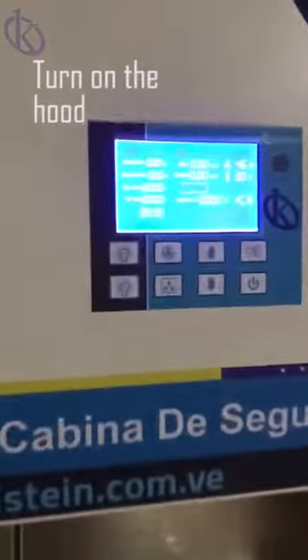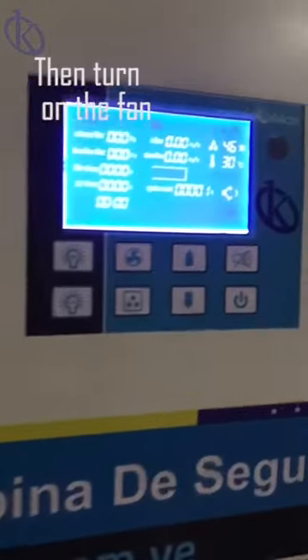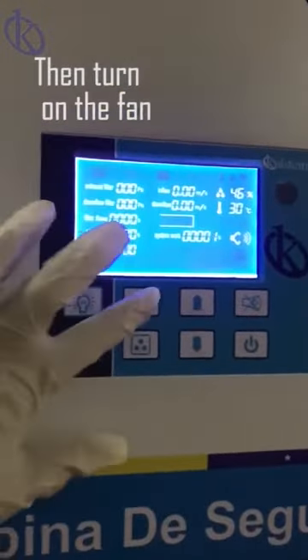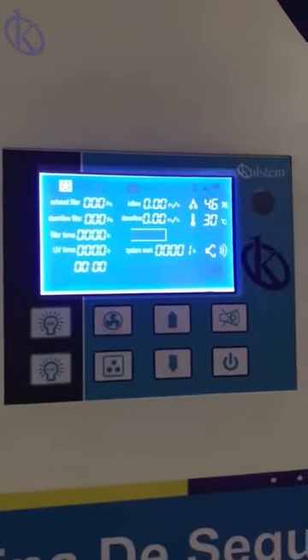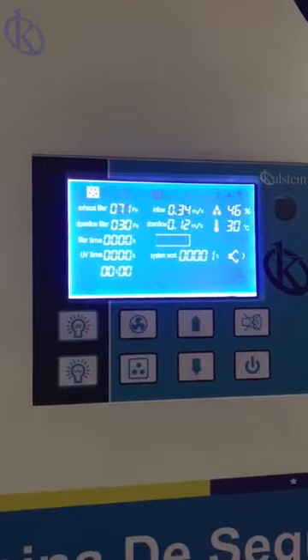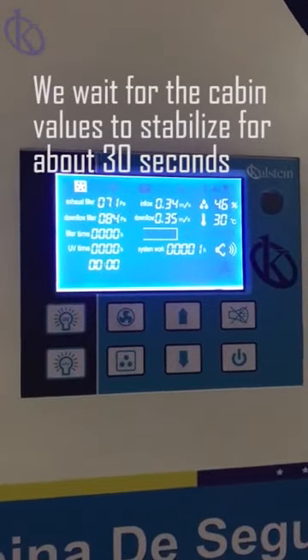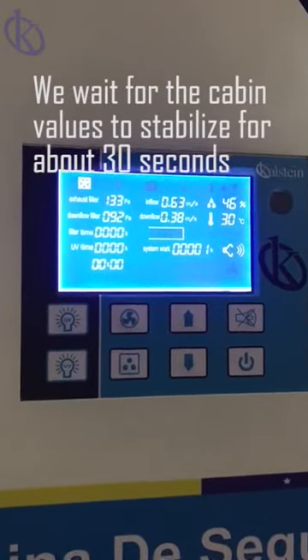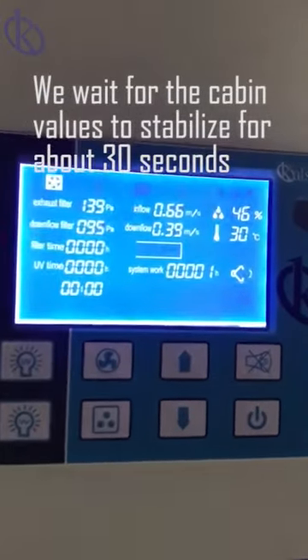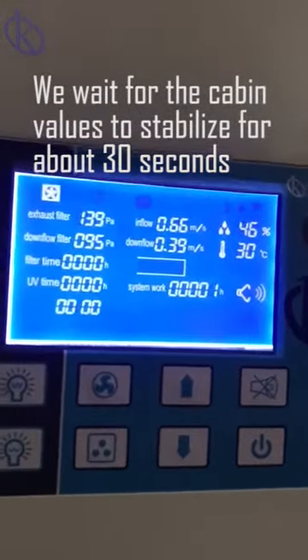First, turn on the hood and then turn on the fan. Then we wait for the cabin values to stabilize for about 30 seconds.